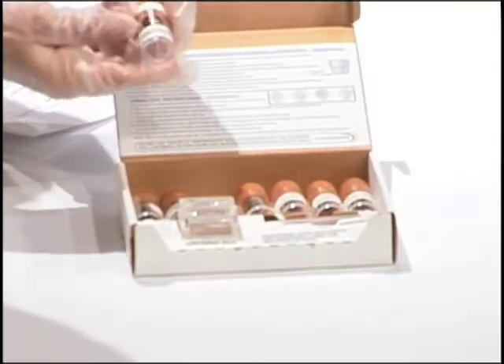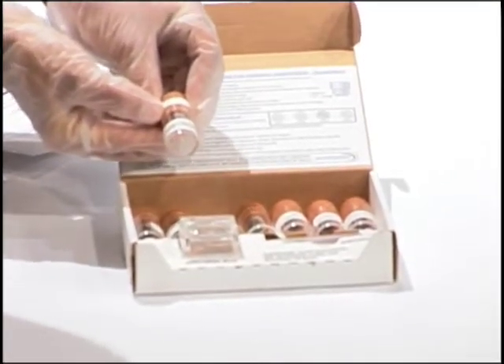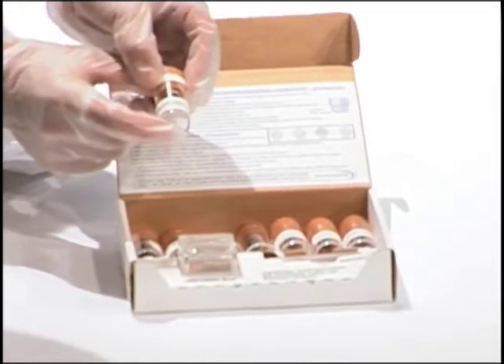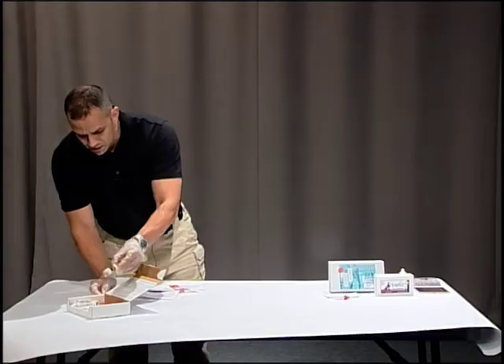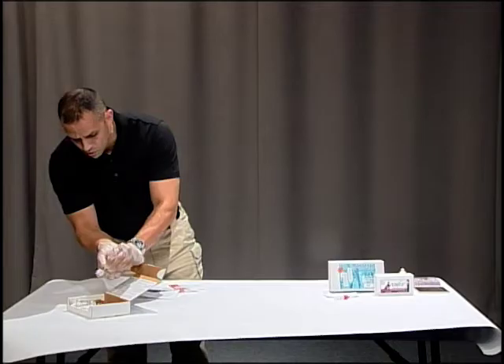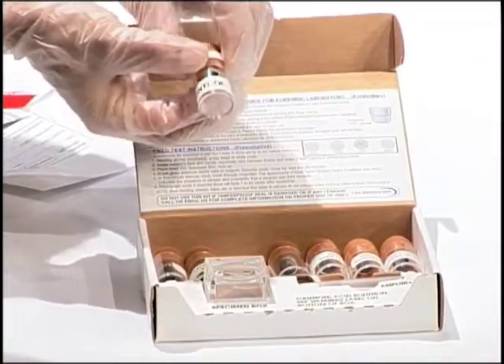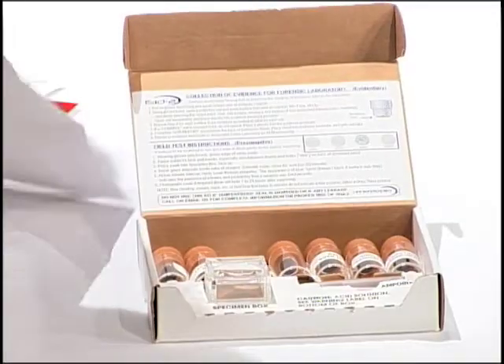The first thing we have is this control. We're not going to open this one — it's just going to be our control, to show that the test is working and that we didn't contaminate anything. It's not going to be opened. You can see there's a seal around the top, and it's going to be put into the envelope just as it is.